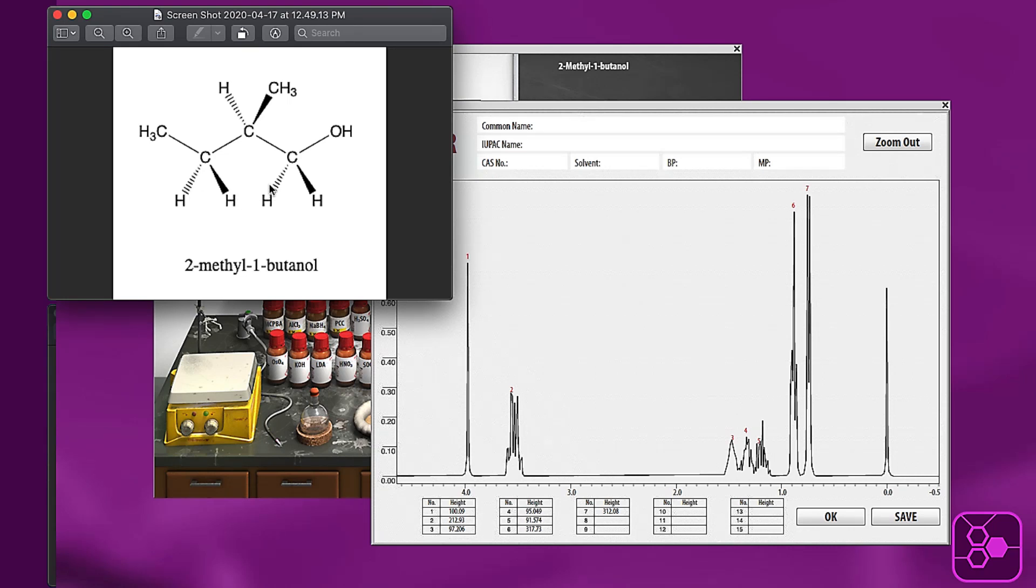So I know here first I would count how many hydrogens this molecule has so I can be ready for that. So we have two methyl groups with six total, and then we have five coming from carbons and one on this hydroxyl. So together we have 12 hydrogens that we're looking for.